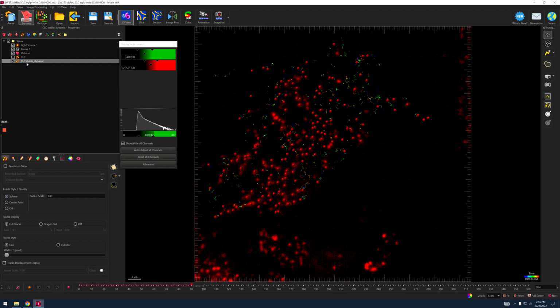In this case, we were not able to analyze the clathrin light chain lifetimes. So the purpose of this is to remove all these uncalculatable spots. Now I'm going to start to demonstrate this.